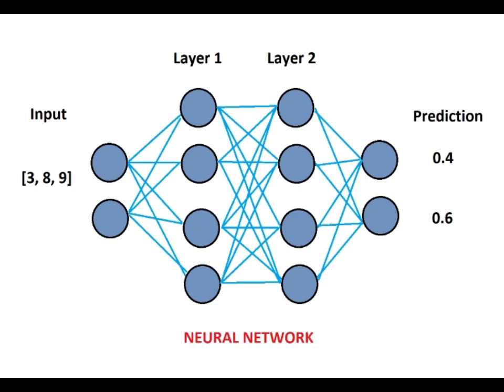Essentially, the data flows from left to right, going through each layer of neurons. Once it goes to the output neurons, it will throw a prediction probability, and we can compare that with its actual and see how wrong that prediction is or how close to being true it is. So one parameter to determine that is the loss.